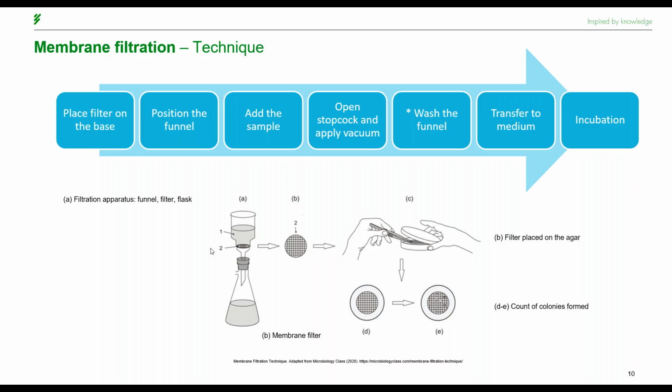A single filtration apparatus or a manifold system can also be used for simultaneous filtration of multiple samples, which would prove very useful when the volume of analysis is important.